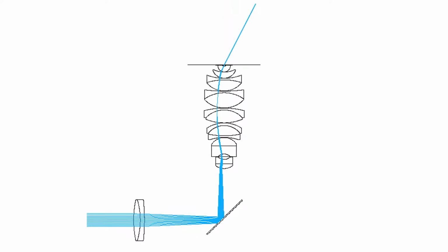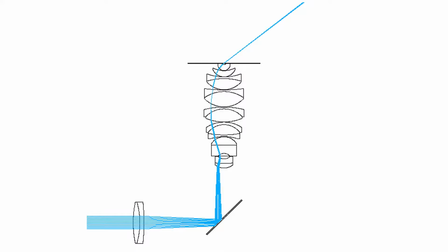If I laterally offset the position of the simple focusing lens from the optic axis such that the beam moves transversely and radially along the objective lens back aperture, we see that the collimated beam begins to emerge from the top of the objective lens at an angle with respect to the optic axis. I can continue to increase the lens's lateral offset to further increase the angle of the collimated beam emerging from the top of the objective lens.